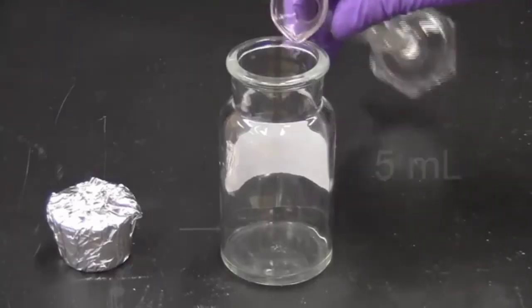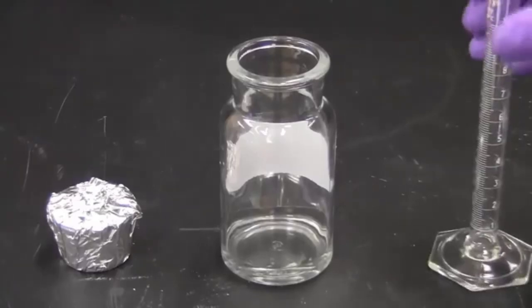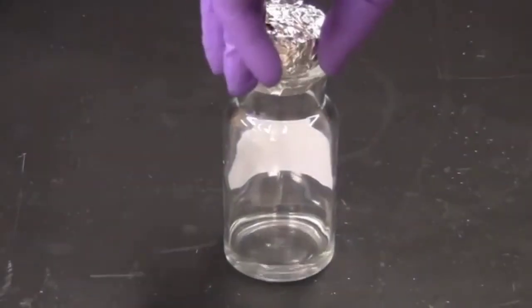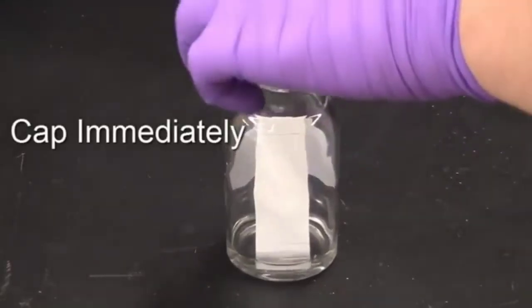To prepare the TLC chamber, add 5 milliliters of solvent. We usually use a 7:3 mixture of hexane and acetone. Cap the chamber for several minutes and allow the gases to reach equilibrium. Use forceps to place the TLC plate into the developing chamber. Cap the chamber immediately.